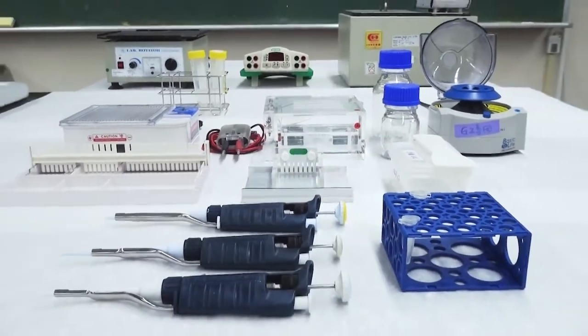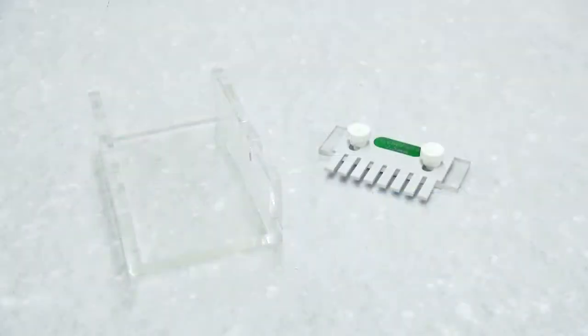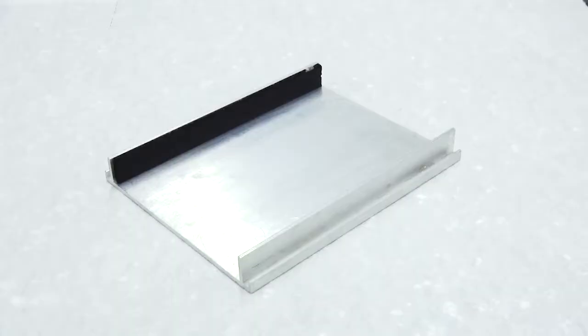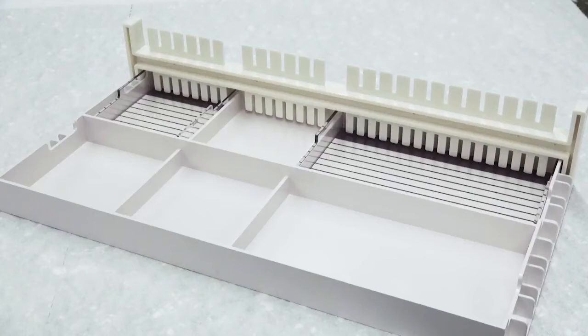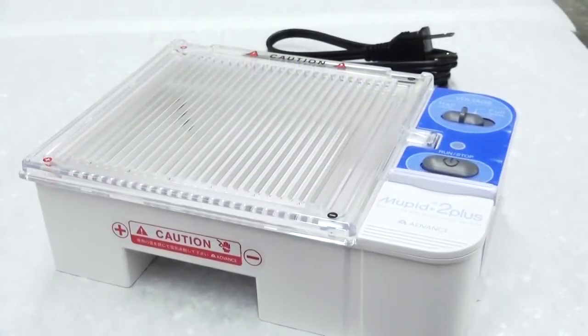In addition to general lab equipment, we need a gel tray, comb, casting plate, and tank with electrodes. You can also use a system with fixed length combs like this.